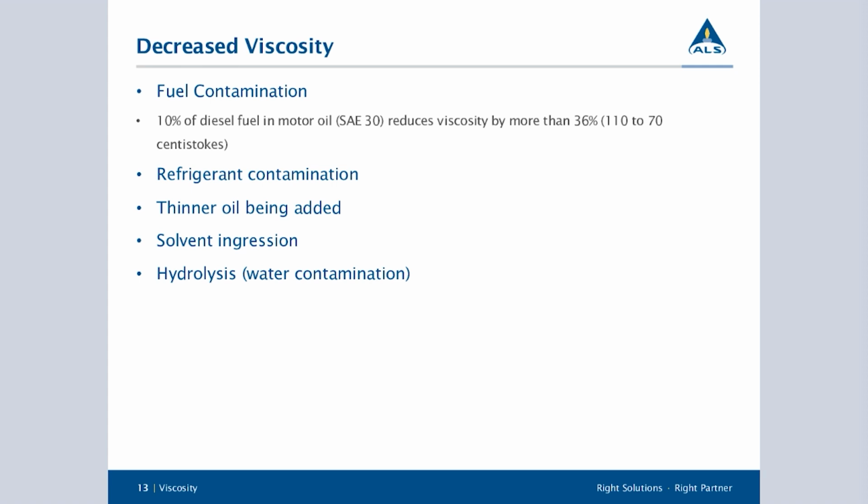Sometimes if you're testing it and you're saying, oh no, I know there's fuel in here, I want to know what it is and what I need to do, that's more reactive maintenance. Preventative maintenance is where you've said, okay, I want to maintain my equipment, I'm going to continue to test all the time, and I'm starting to see that there is fuel contamination. What should I do about that? And so that's where you address the issue before it happens.